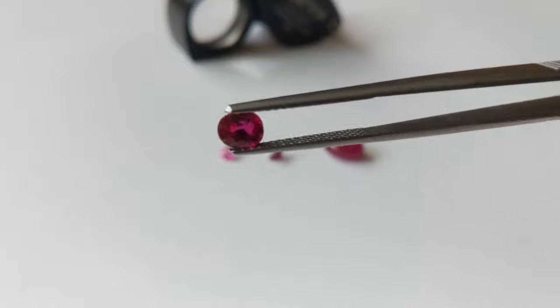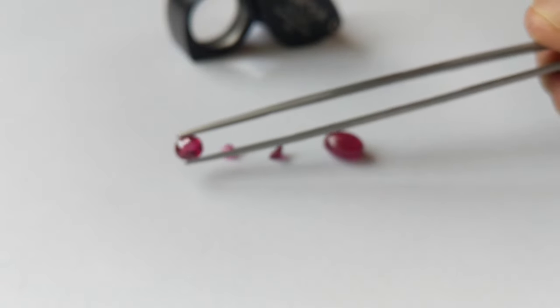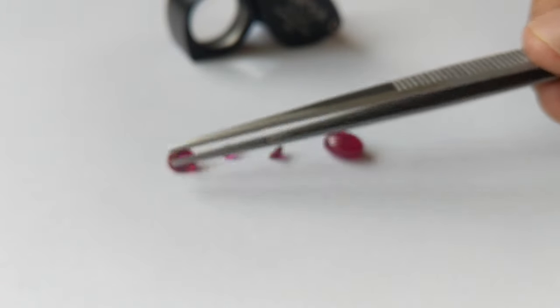And the last one right here is a beautiful pigeon blood clean one carat stone. So do you think this is synthetic or real? All right now let's give five seconds before I give you an answer.